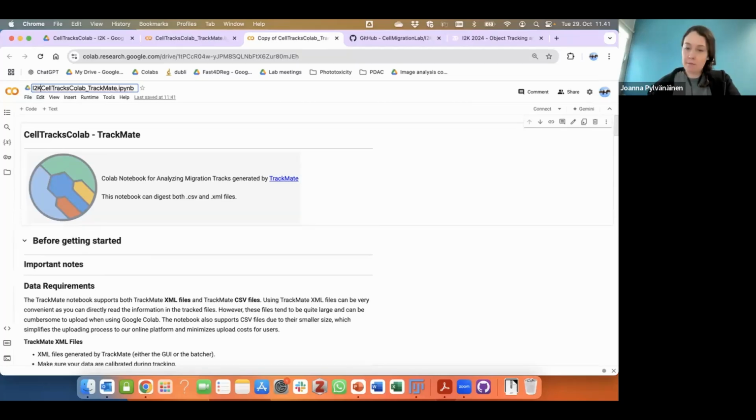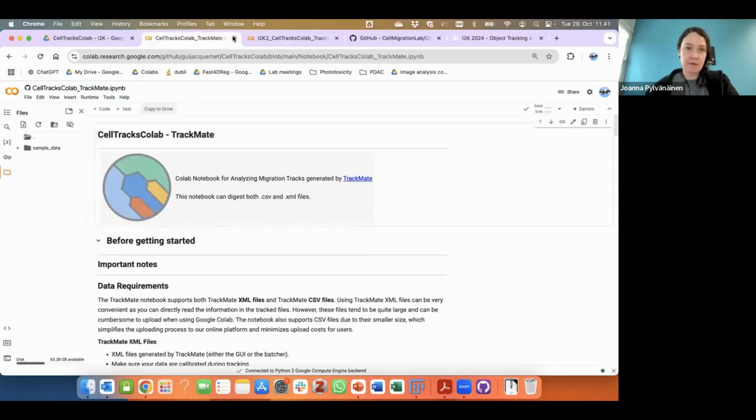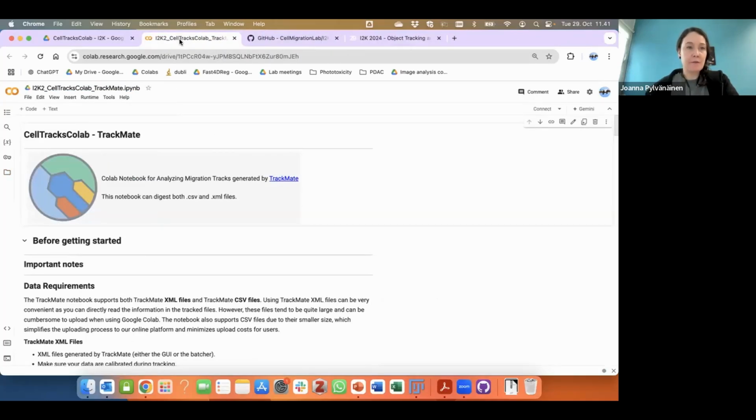This is, for example, because these notebooks are updated all the time if new bugs are found. If you save this notebook as it is for your version, for your experiment, you can always go back and see exactly what was used in that notebook.